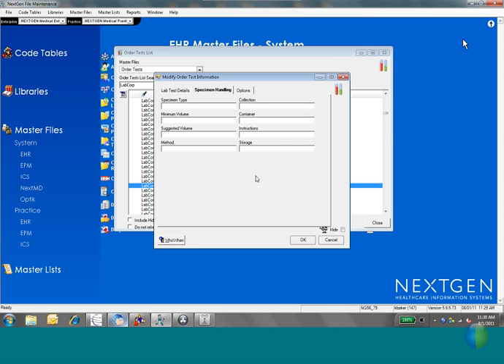It's just extra steps you don't need to fill out. But if you have users that collect a specimen who need this guidance, then you definitely want to fill this out for tests. They're just free text fields, so you can type in whatever is expected by the lab.